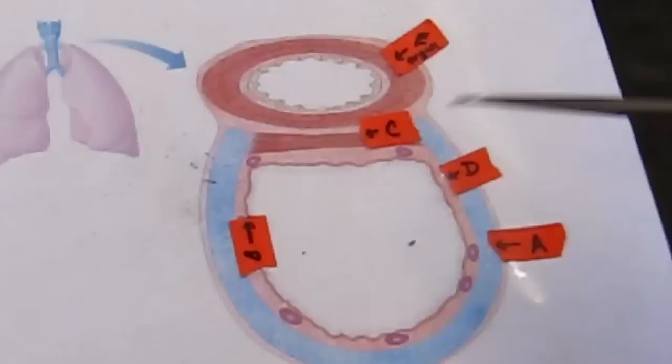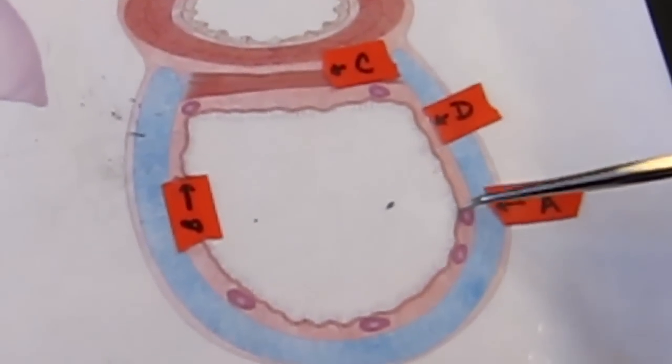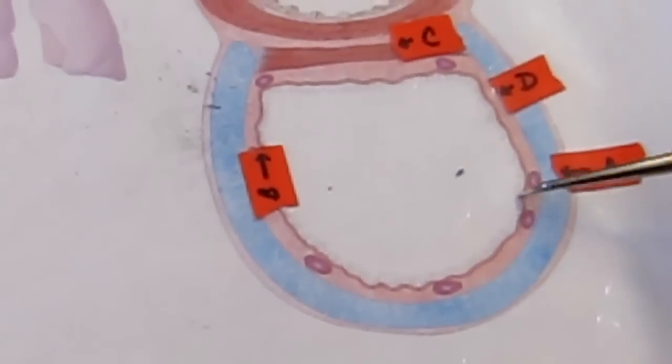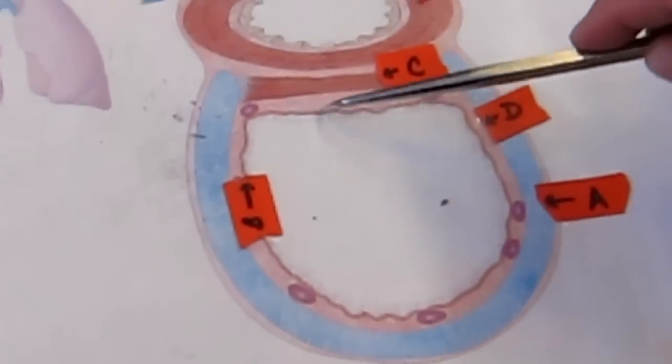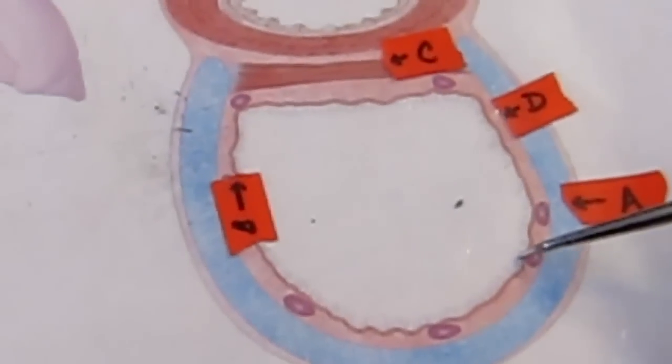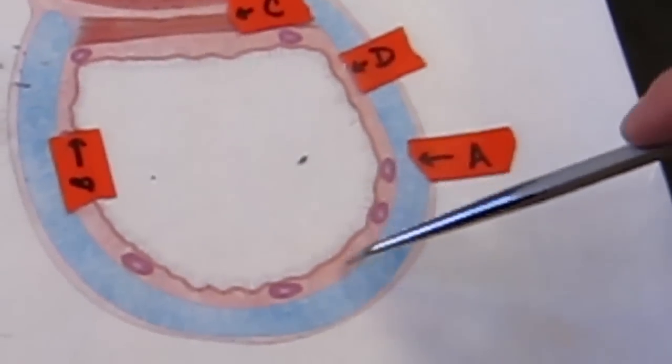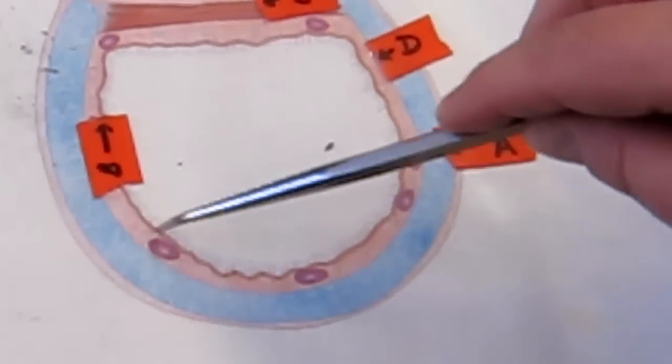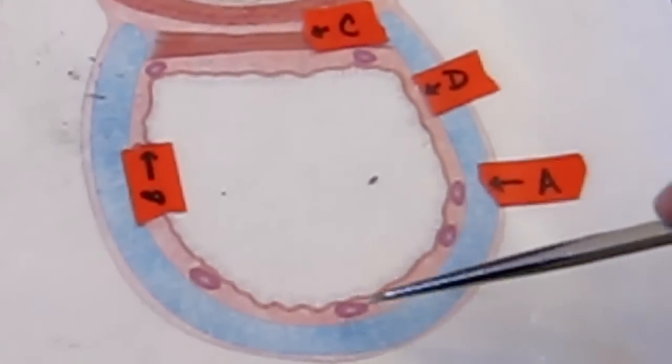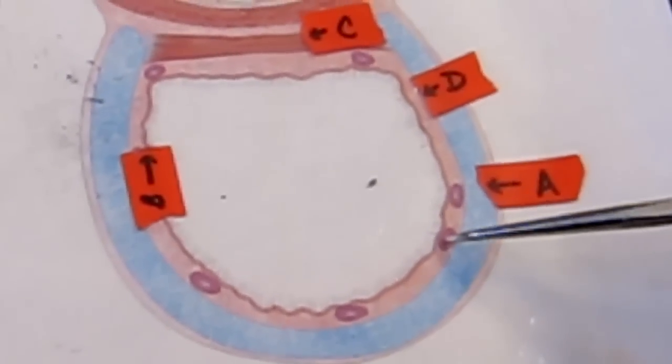So let's start with the layers as we're starting from the lumen. The layer of the trachea wall closest to the lumen is going to be the mucosa, and the mucosa in this picture looks like it has these little hairs on it, and those are the cilia of the epithelium that we find here, and we'll look at that epithelium in a minute. As we move past the mucosa, we get to the submucosa. In the submucosa, you'll see a lot of blood vessels because this is a connective tissue layer, and you'll see these larger structures which are represented in the purple, and those are mucous glands.